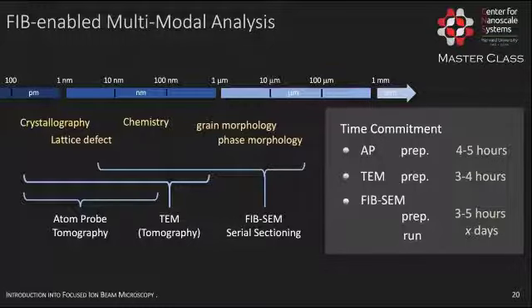The 3D imaging analysis that you saw scales with the volume, right? So if you just want to probe a small volume, it's relatively quick. I haven't talked about 3D imaging, so basically it comes with a little bit of overhead because you need to prepare fiducial markers that the electron beam and the ion beam can use within the control software to precisely position the cut position and also the imaging position. So you need to prepare the material, which takes, depending on the volume of your material, between 3 and 5 hours. A run then in the end can run automatically over several days.